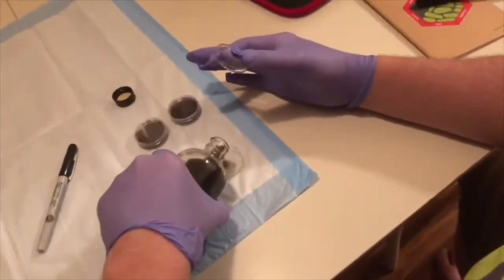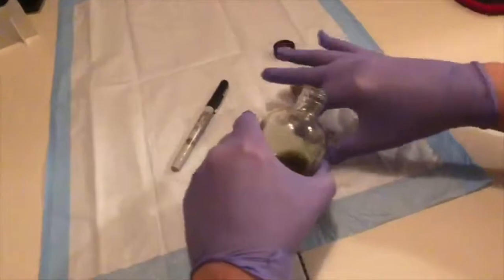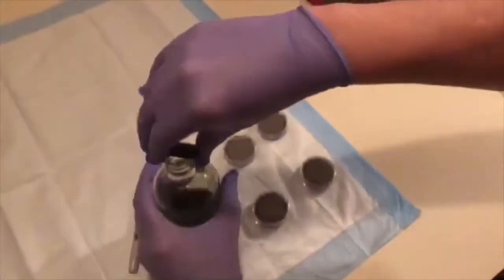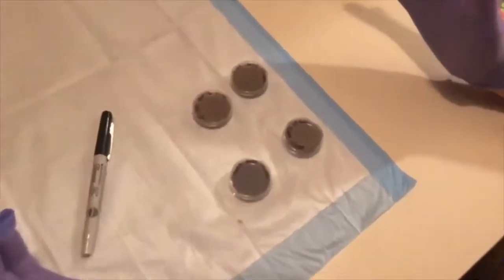For me, it's just easy to do them in this kind of quadrant pattern so that I don't stumble over myself. But whatever, if a straight line works better for you. Cap my media, and now all we do is let them cool until they're solid, and then we'll be able to inoculate them.